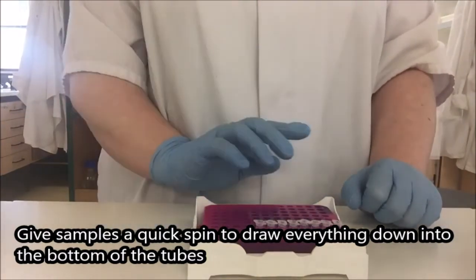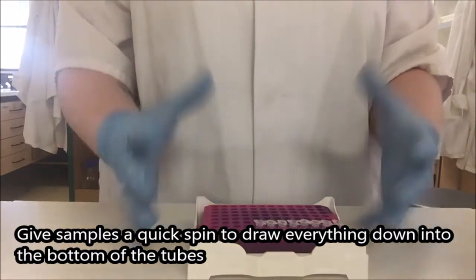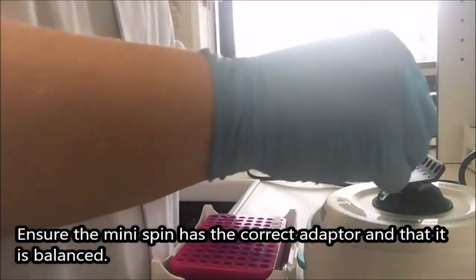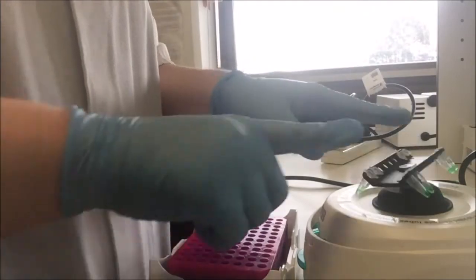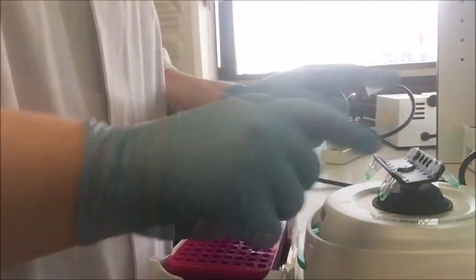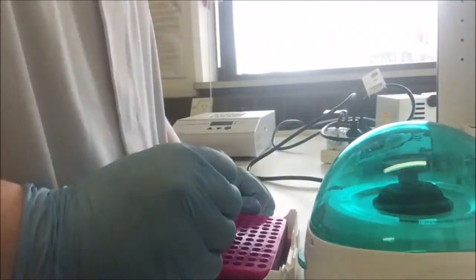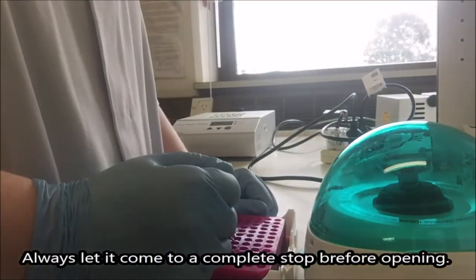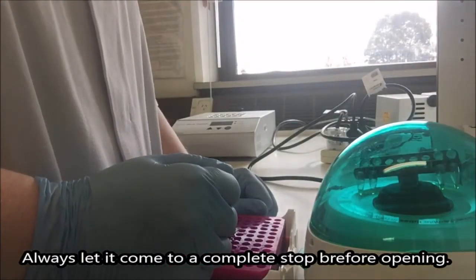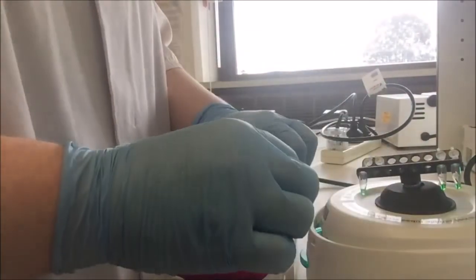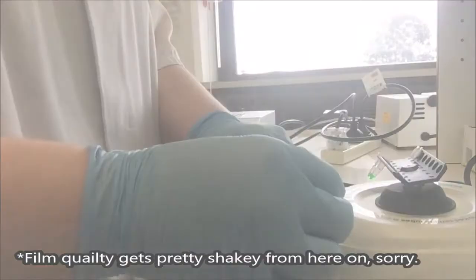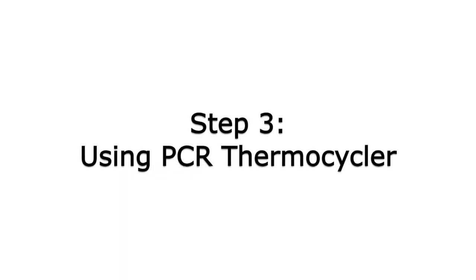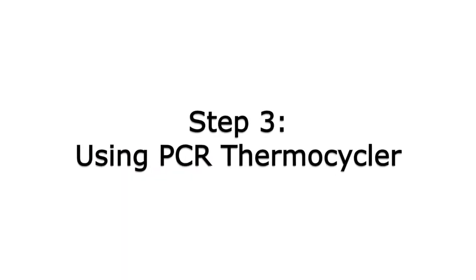So I'm going to put these in the mini spin that we've seen earlier to draw everything in the tube down into the bottom. I'm going to make sure that this is balanced. I've got two sides and I've got two tubes at each corner. So lid on. I'm going to make sure that I am careful taking these out. I don't want to bump them and have to re-spin them.